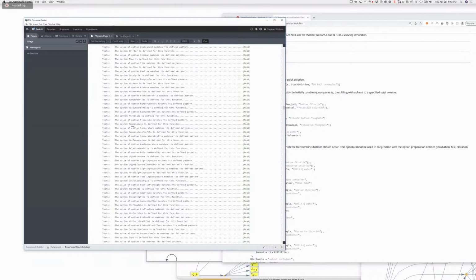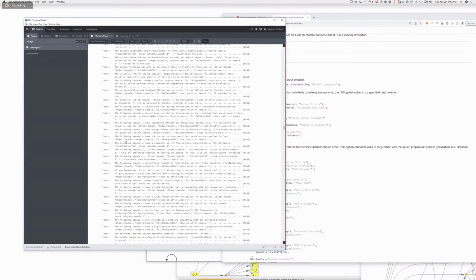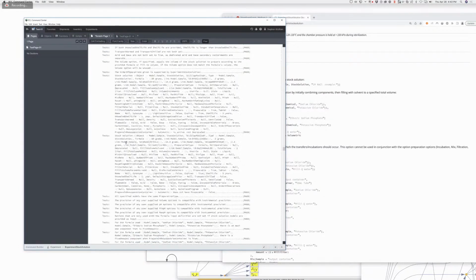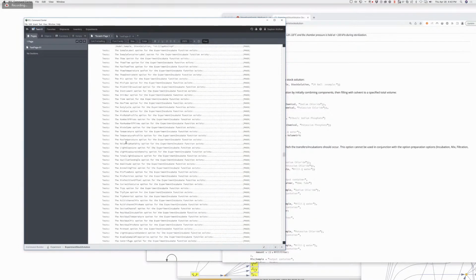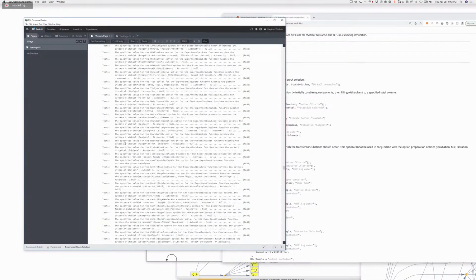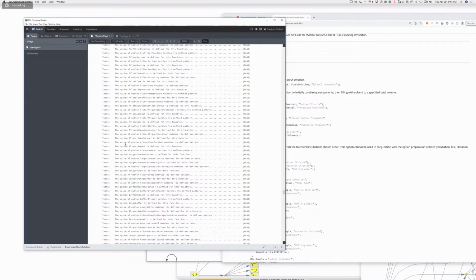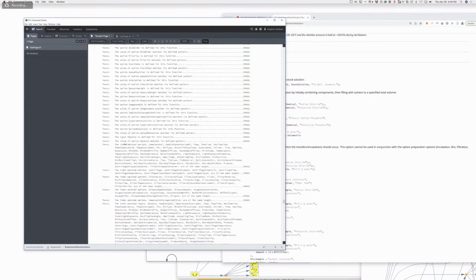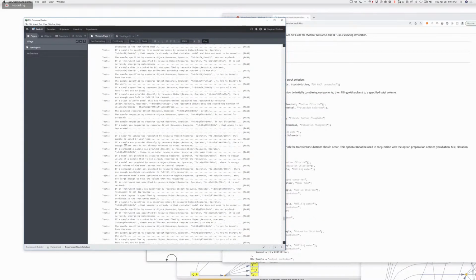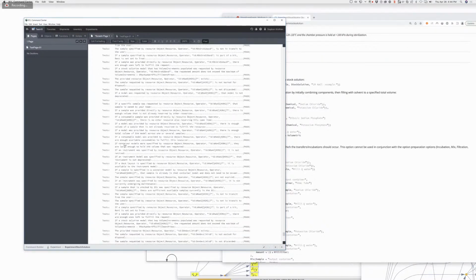You said filter volume goes to volumetric. You can't do certain things in volumetric flasks because they're kind of special containers. So there are checks that make sure you're not trying to do something like stick an overhead stir in there because it doesn't fit. Stuff like that. Checking the precision of the amounts that you specified to make sure that they can be achieved using the instrumentation we have in the lab, like the tolerance or resolution of the balance, whether it can weigh out the precision of the mass that you specified. Otherwise, it rounds it and gives you a warning. That's sort of the hairy guts too.